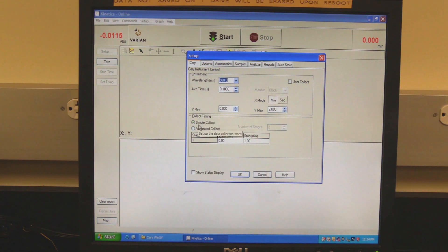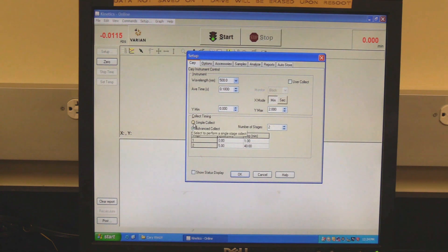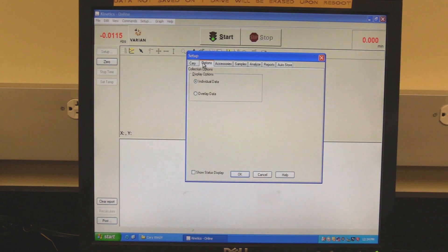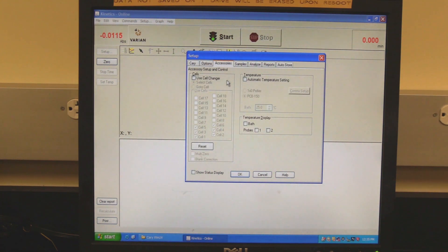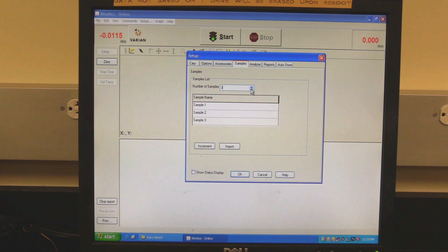In collect timing, select simple or advanced collect. Use simple if there is only one stage. Use advanced if there are multiple stages. In the cycle column, set the cycle duration. In the stop column, set the end time for the reaction stage. Click on the options tab. Set whether to display data individually or overlay. Click on the samples tab to set the desired number of samples. Click the up arrow to increase or the down arrow to decrease the number of samples.